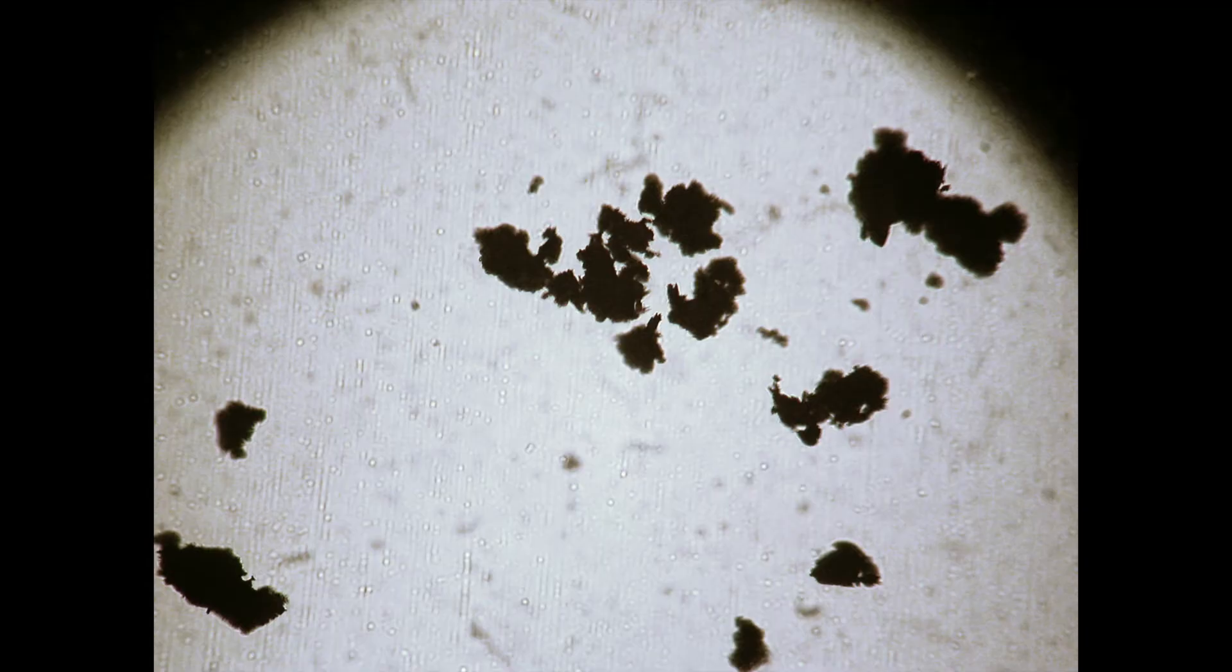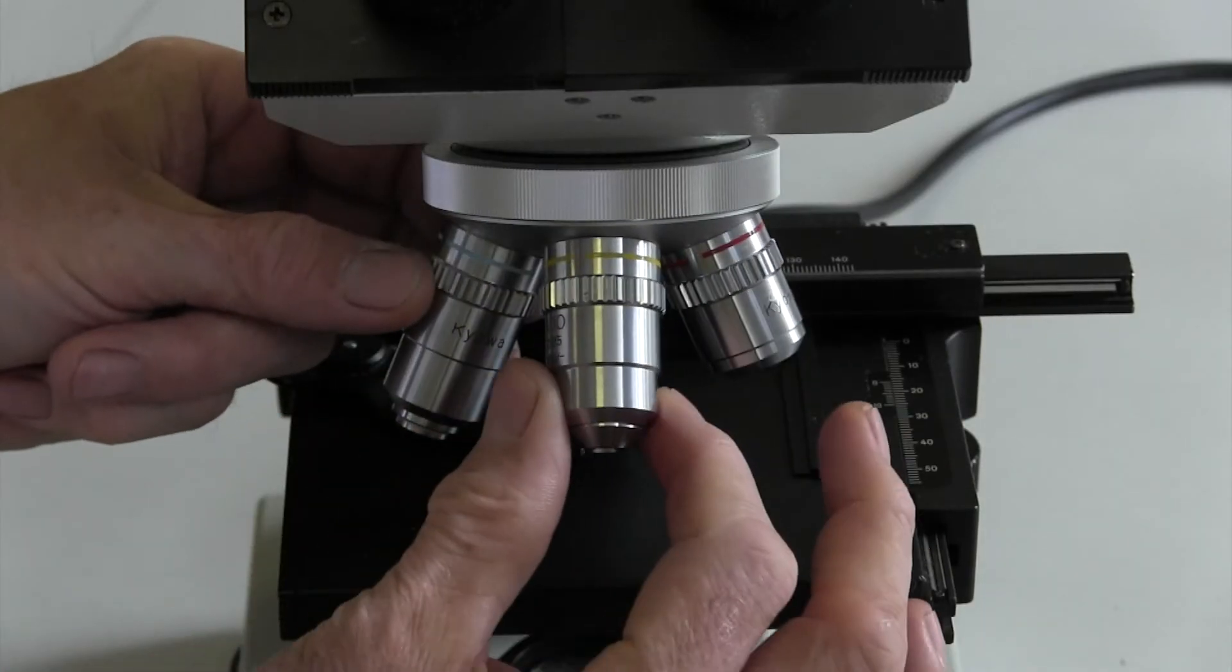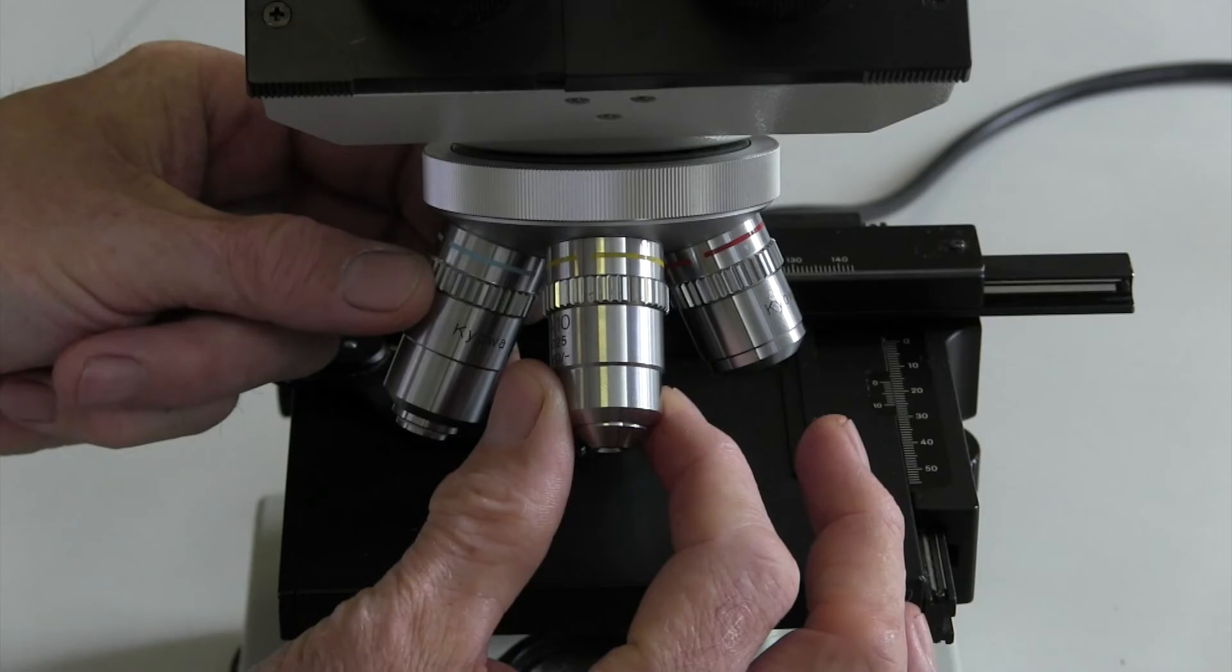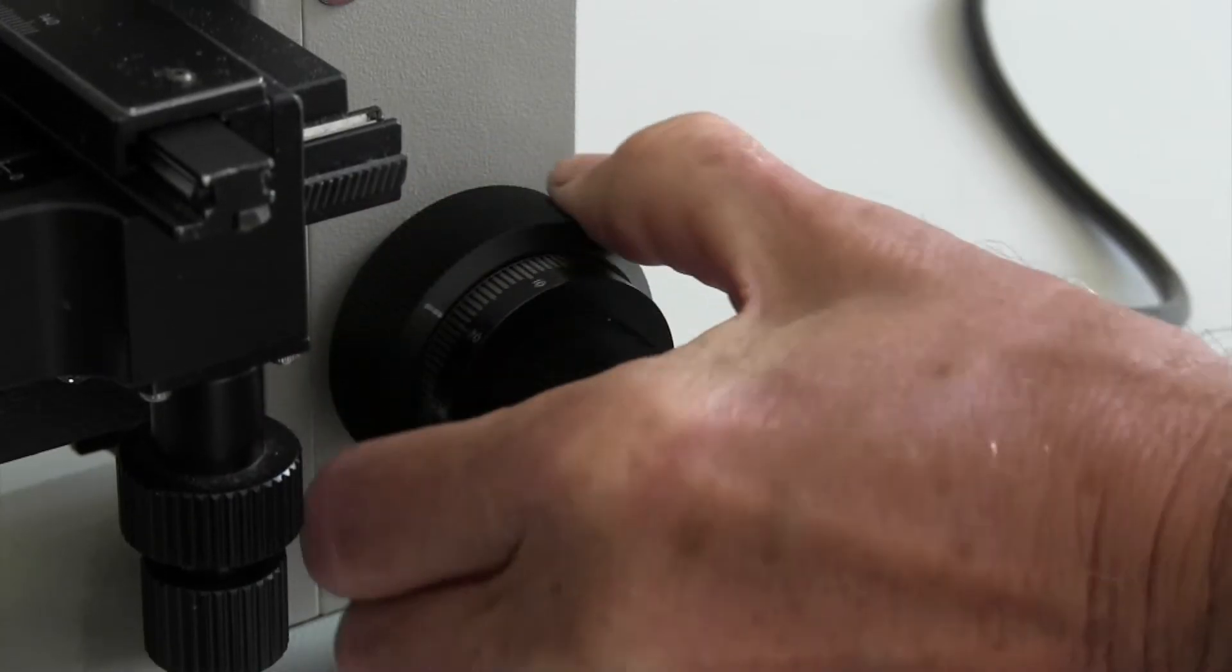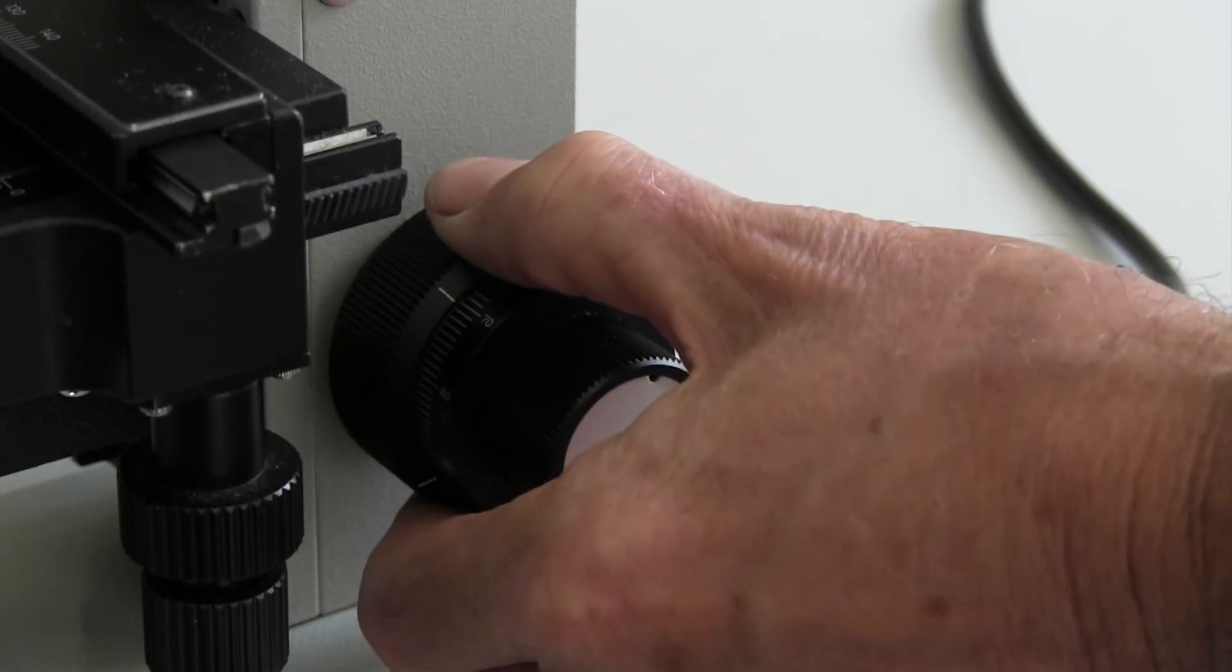Although whatever it is you have on the slide will be out of focus. For this exercise, make sure you have the 10x objective, that's the one with the yellow band, in position and use the coarse focus wheel to wind the stage down slightly to get better focus on your mark.